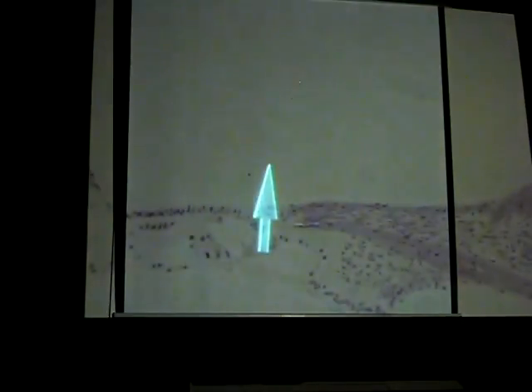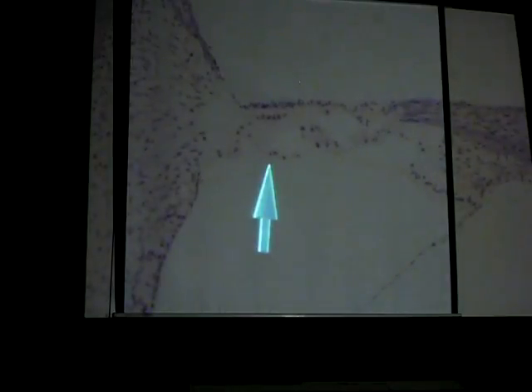All right, so if we go over to this side, we can do the same thing. We see our organ of Corti here, that's the basilar membrane. Facing that would be the scala tympani. This would be the scala media, that's your vestibular membrane. So this cavity here would be your scala vestibuli. And in this one, you can actually see the tectorial membrane sitting on top of the organ of Corti. So this would be your tectorial membrane.